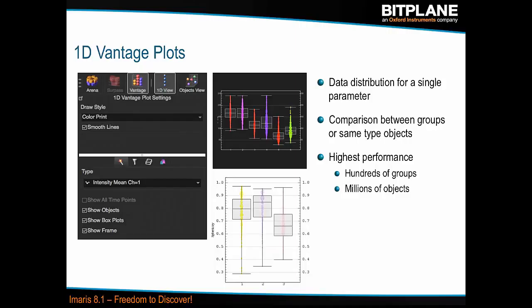Vantage is, I love it because of the options that it has and how cool it looks. It's impressive, but it has a limitation, which is that it requires the same amount of memory as Surpass requires.